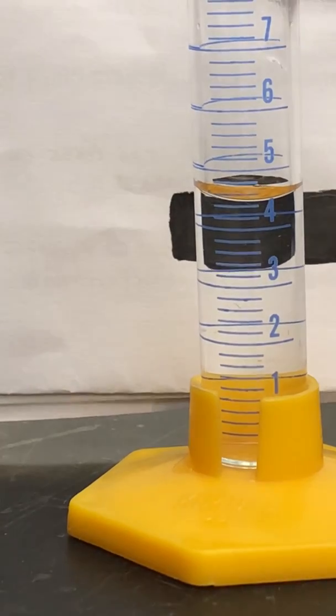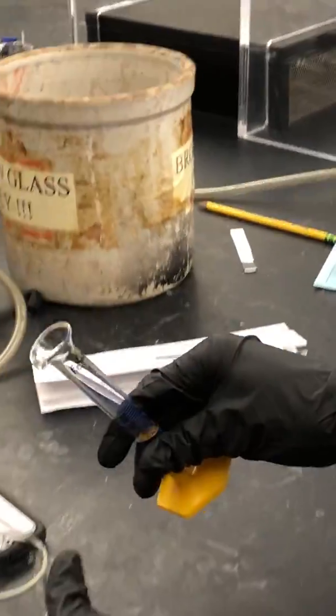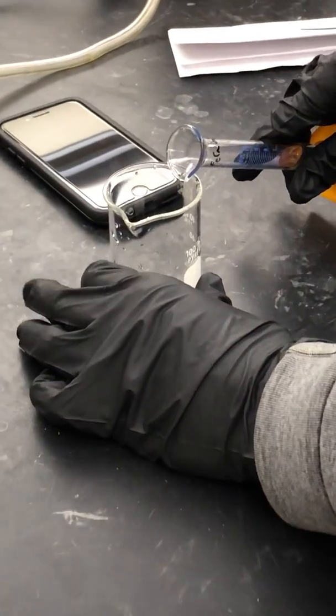We have about 4.45 milliliters here. Once we want to transfer, we're going to take our graduated cylinder, put the spout on the lip of the beaker, and then pour.